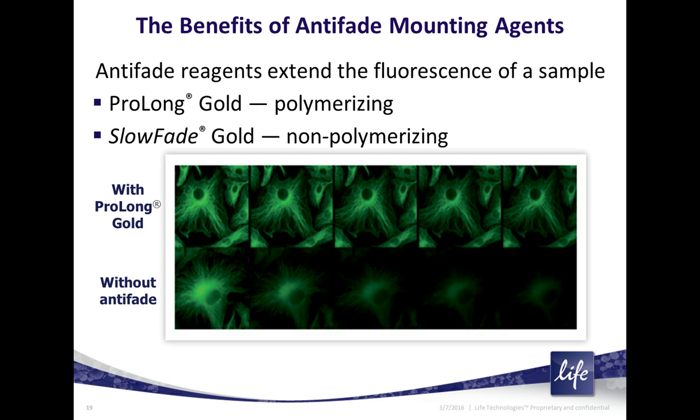Then you take your cover slip and just lightly touch the tip of it to a Chemwipe to wick off any excess buffer. And then you turn your cover slip over onto a drop of your mounting medium on your slide. Now, there are a lot of different commercially available mounting media out there, and some people make their own even. I highly recommend using an antifade mounting medium.